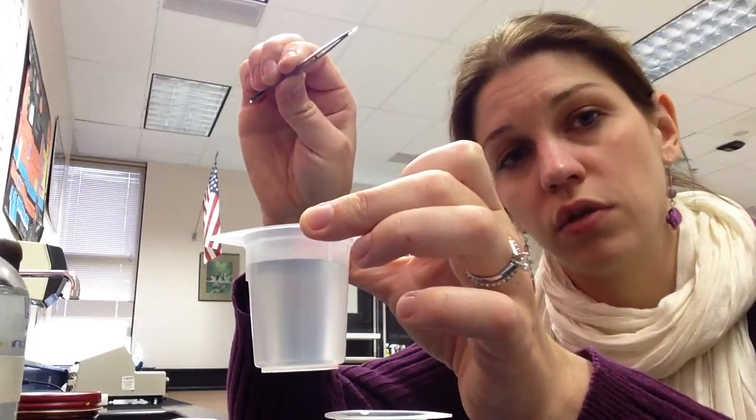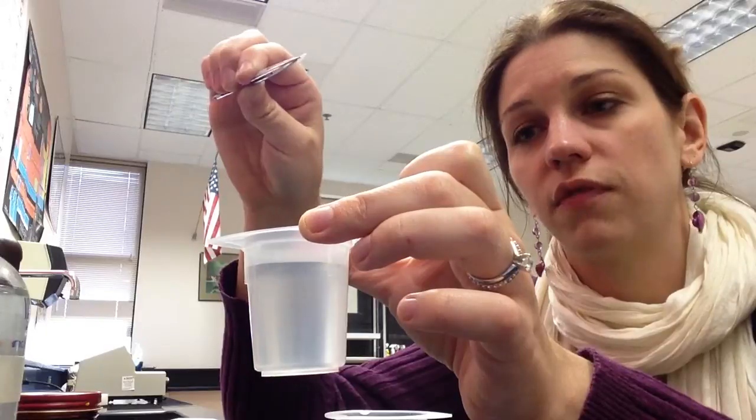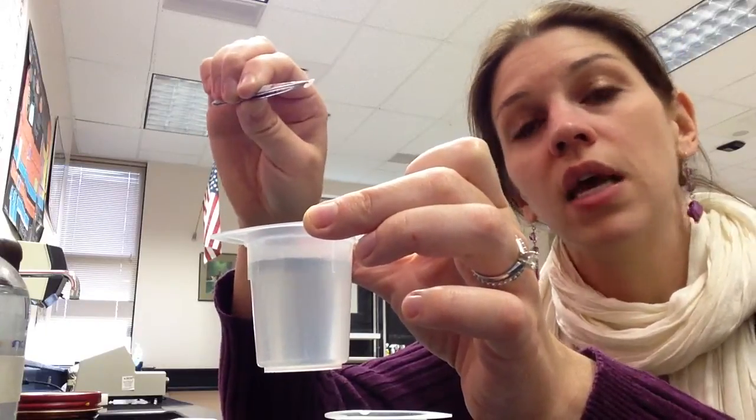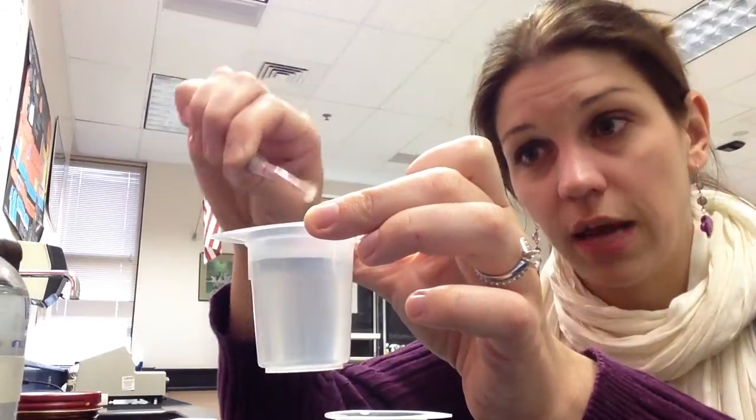And so for us to measure the rate of the reaction, you're going to measure how much time it takes for it to go back up to the surface. If it sinks first, that's okay. You're just measuring how long it takes to get back up to the surface.